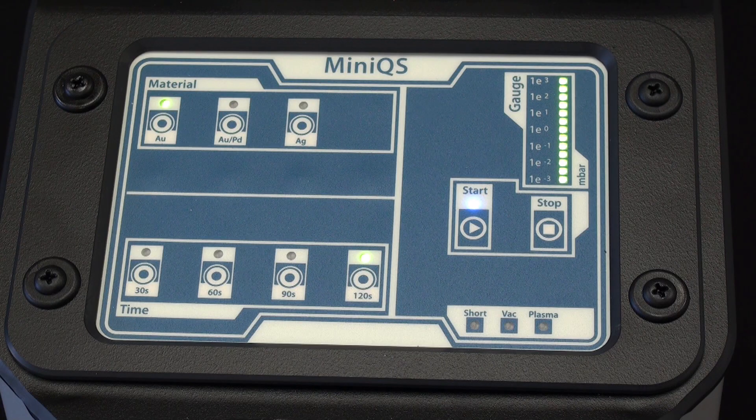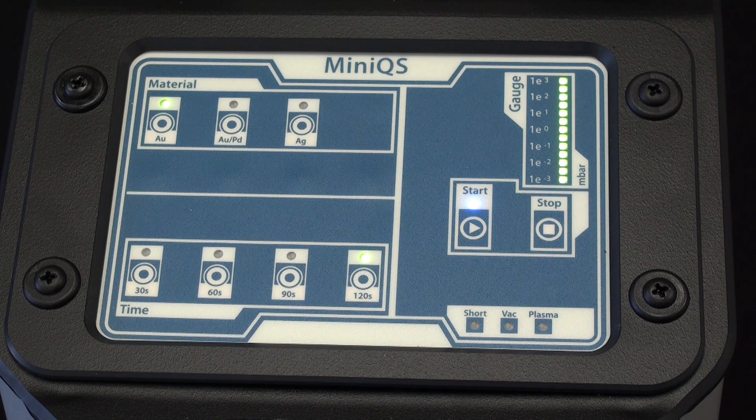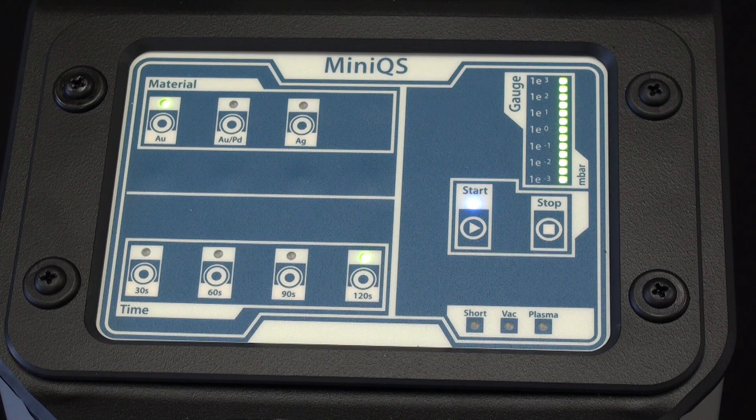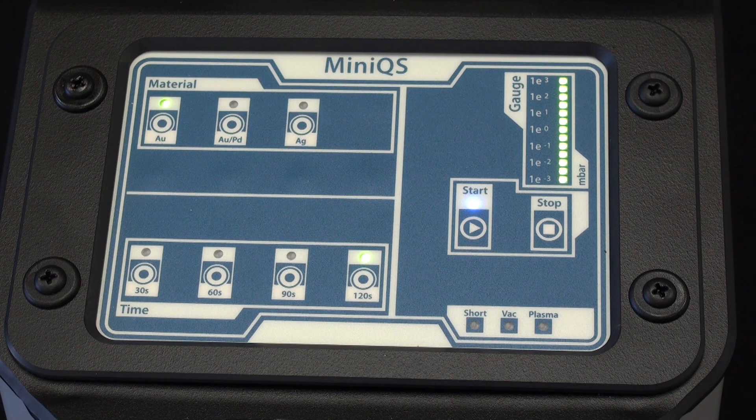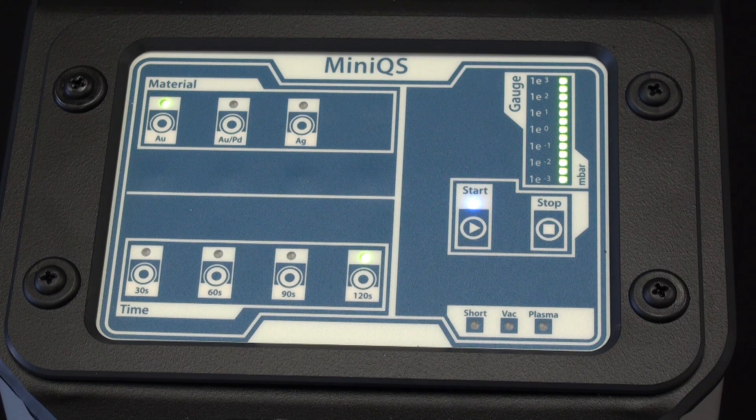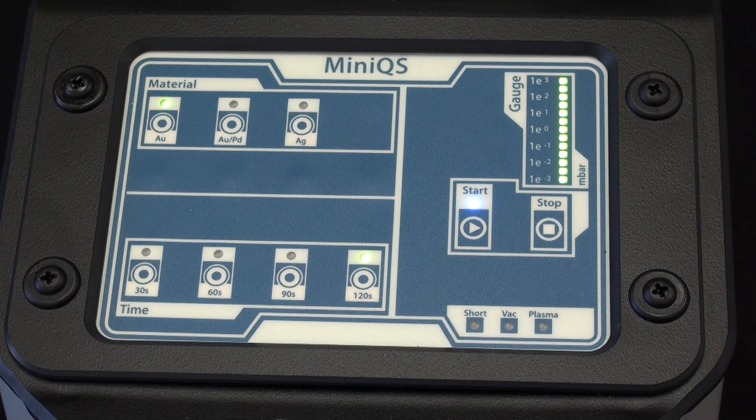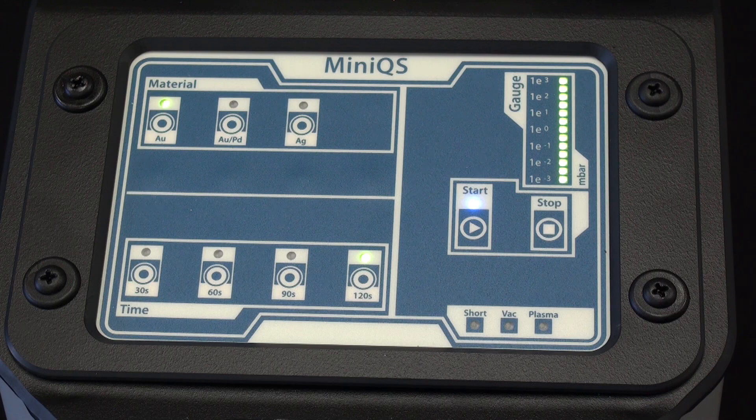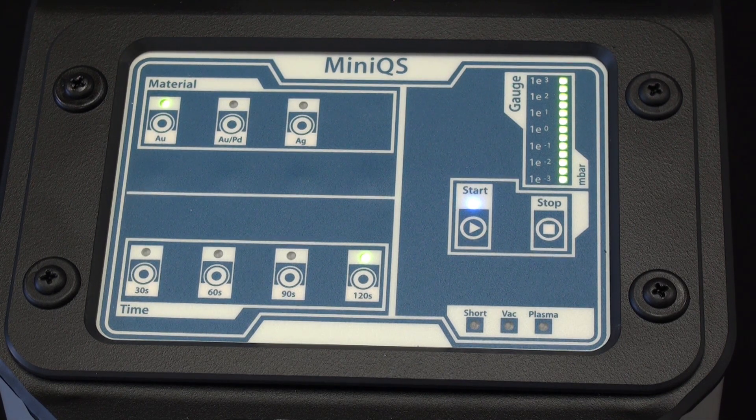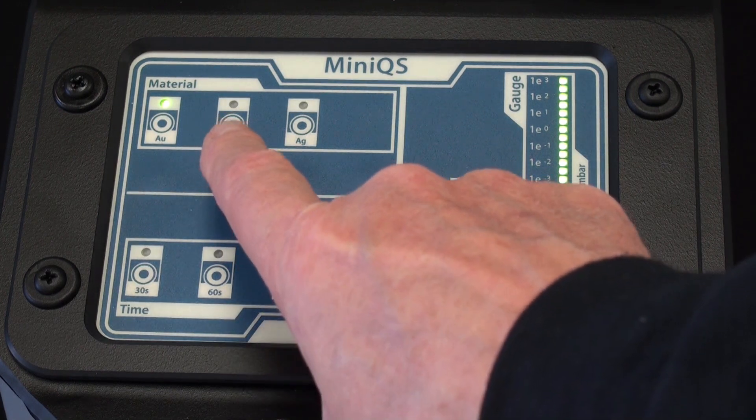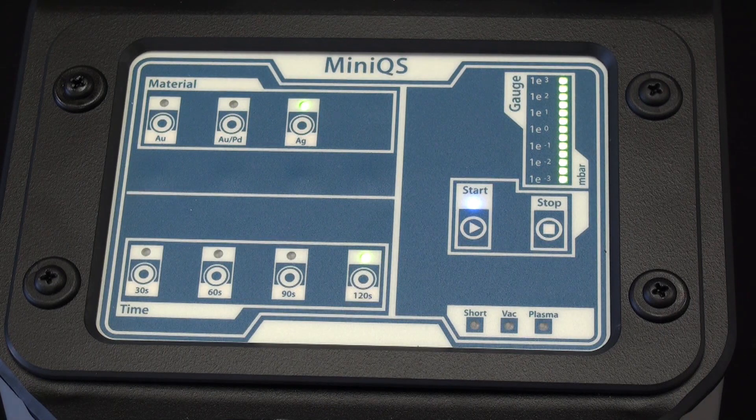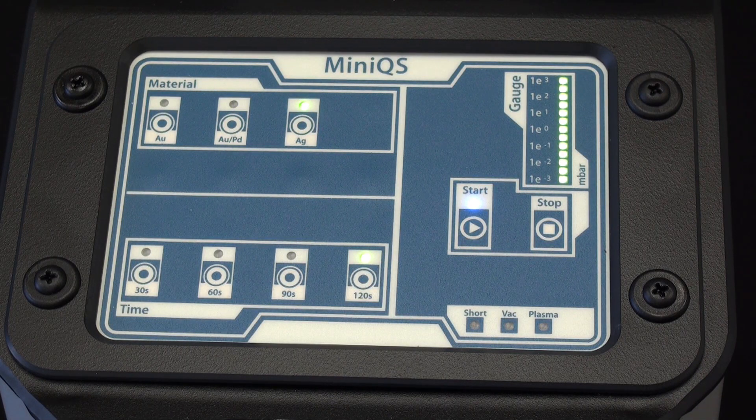The MiniQS is an entry-level sputter coater meant to produce coatings of three materials: gold, gold palladium, and silver. The material that's installed in the sputter head needs to be changed if you switch materials, but as far as the instrument goes, it's as simple as pressing a button to select the material that you wish to sputter.